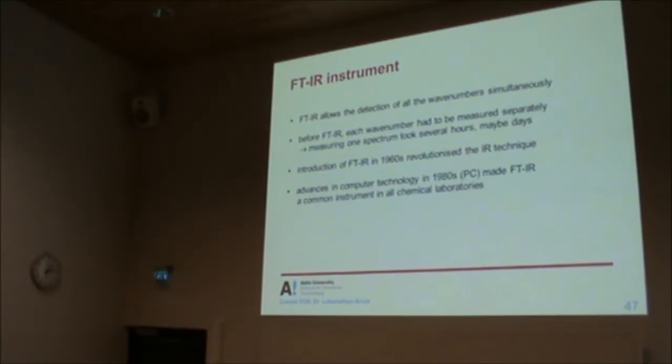Before, you used to use dispersive infrared spectroscopy, which was more time consuming, and the change was mainly driven by the increase in the power of computers. Now you hardly find dispersive infrared spectrometers. I think almost all spectrometers that I have come across all through my life are FTIR.